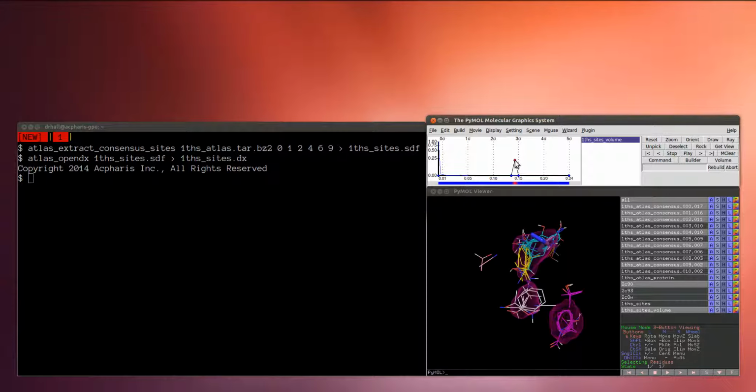If we want to adjust this, we can click on it and pull it up and it becomes more intense, or pull it down and it becomes much softer. This is connected to two other points on the baseline, so you don't see the blue, but really there's a gradient where if the density is at this level, then it will instead show a color between red and blue at this lower intensity.